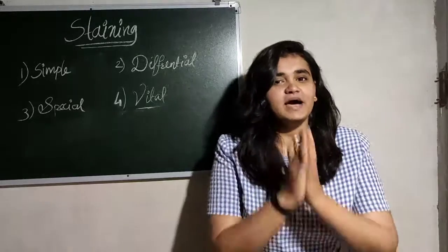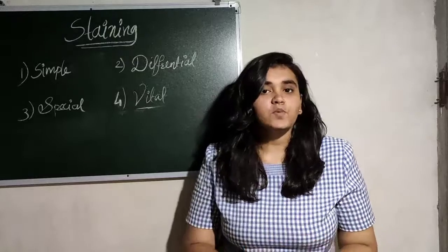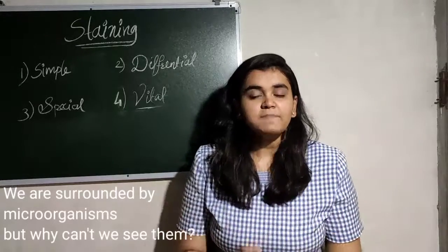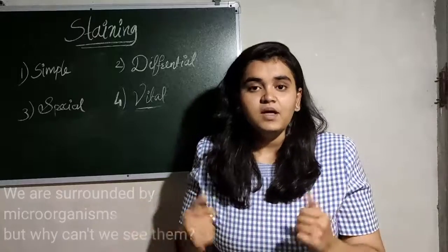Today we're gonna talk about staining. Being a microbiology student, staining is the most important thing to know. Why is it so? We have microorganisms all around us, but why aren't we differentiating them? Why can't we see them?